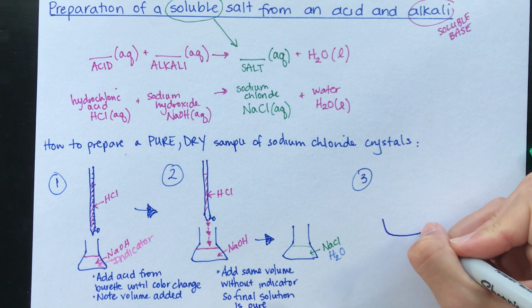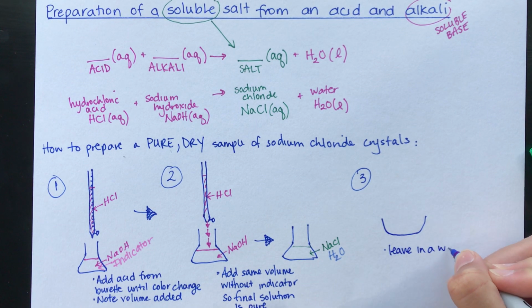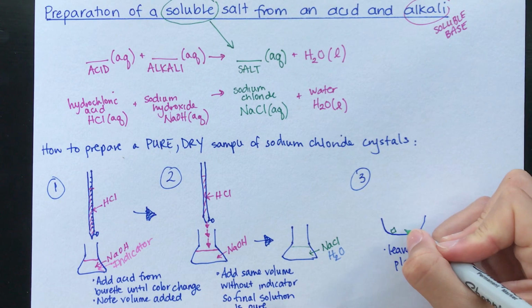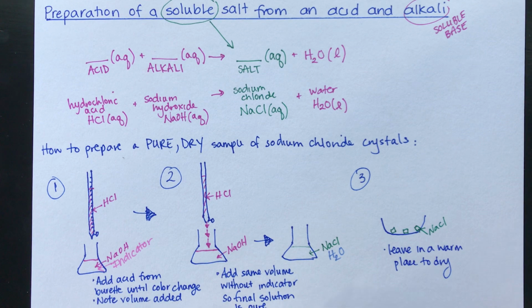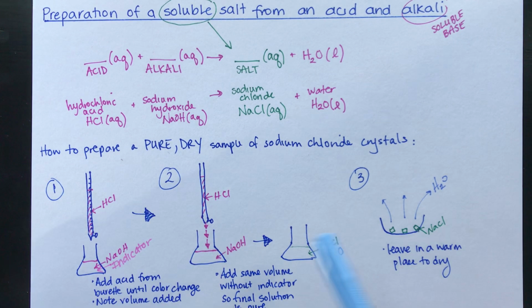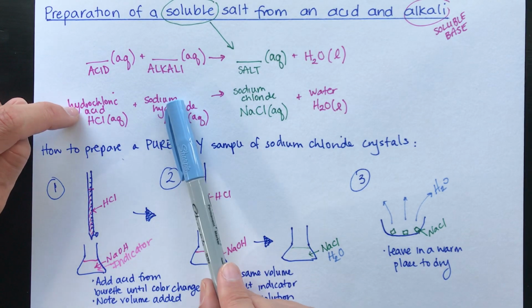In this one, I tend to just get an evaporating basin, leave it in a warm place to dry. Get some nice cubic salt crystals, and all the water evaporates. In theory, you could do the crystallization method that we did in the second video, but for NaCl I usually don't bother. You get really nice crystals this way, and crystallizing NaCl by making it a saturated solution is really challenging, so we don't usually use that method. But that's it. This is how you make a soluble salt from two solutions, an acid and an alkali.